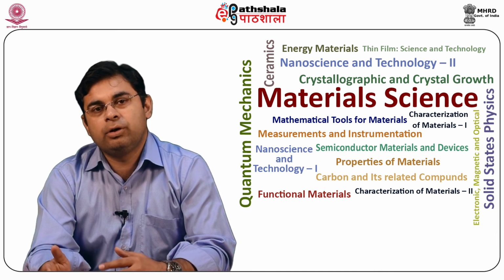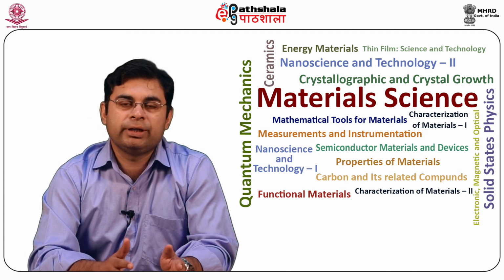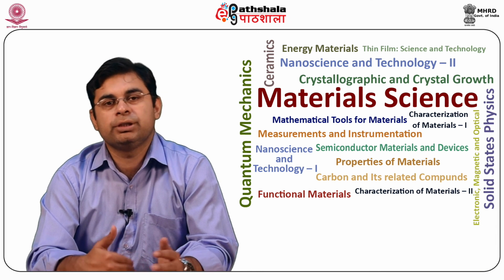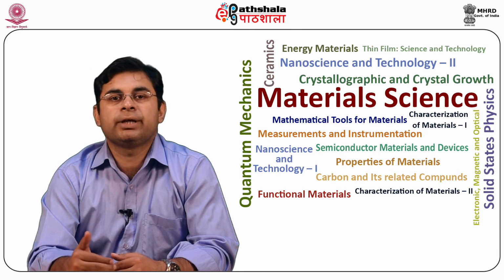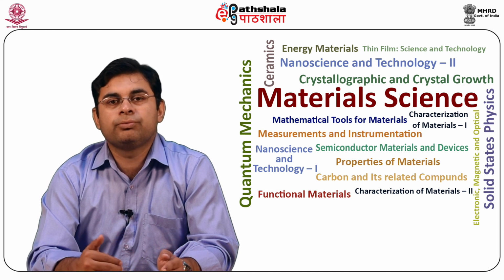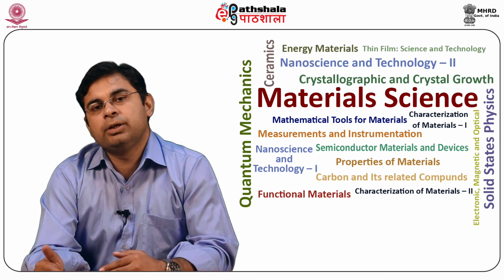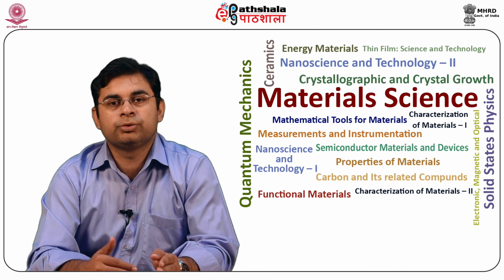For a good phase contrast, larger tip forces are of advantage, whereas minimization of this force reduces the contact area and facilitates high resolution imaging. So, in applications, it is necessary to choose a cantilever of appropriate force constant. For tapping, the force constant of the cantilever is generally greater than 20 to 40 Newton per meter, and silicon probes are used primarily for tapping mode applications.